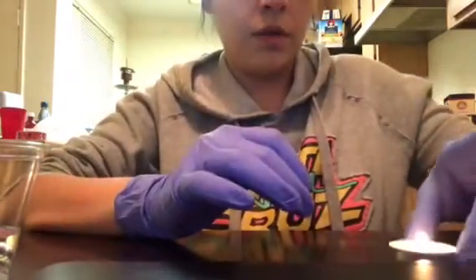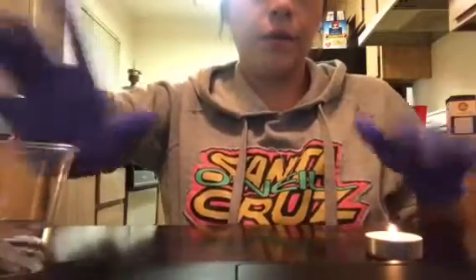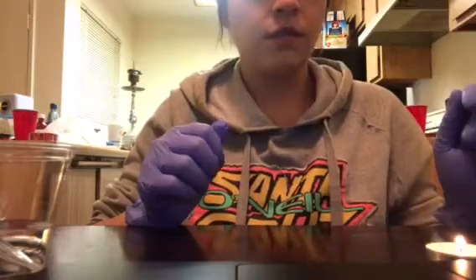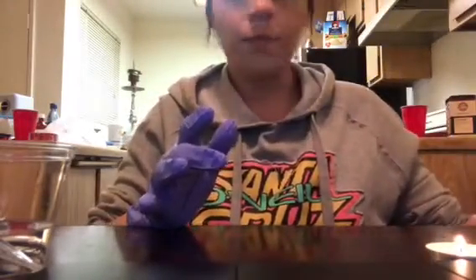So, let me see if I can back this up a little. Okay, so I have my pipette sitting in some alcohol, my candle's lit, and I'm going to be starting with the Cerevisiae test tubes with the nutrient broth that's already the active culture.